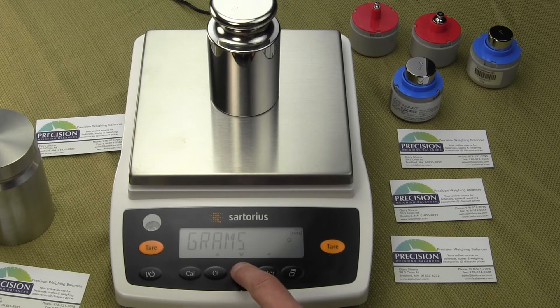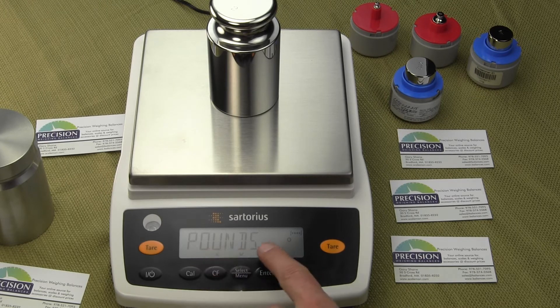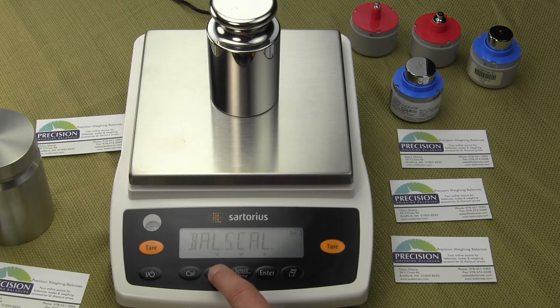You'll see grams with a circle there. We said we want to set up the balance so it only weighs in pounds. Scrolling to pounds — we're on pounds now. To confirm that's the weigh unit we want, we press the enter key, and you'll see a circle appear next to pounds. That circle means the weigh unit will now be pounds. To get out of the menu, press the clear function arrow on the left three times, and now we're resetting the balance. When this balance powers up, it will be in pounds all the time.